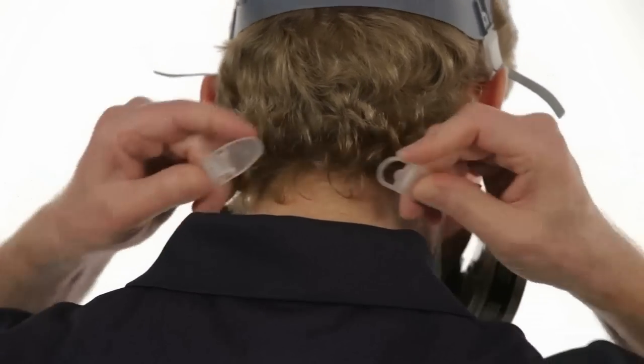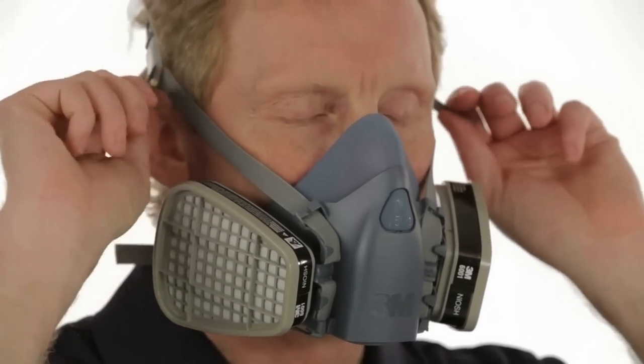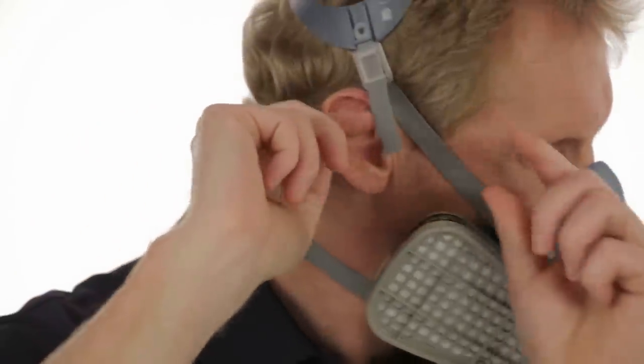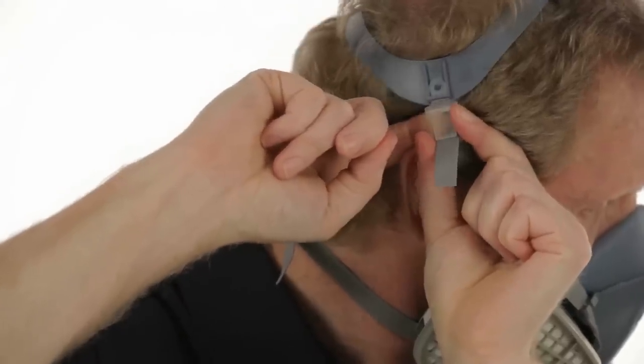Take the bottom straps in both hands and hook them together behind your neck. Tighten the straps by pulling on the ends — top straps first, then the bottom — until the respirator fits securely but comfortably. Do not over tighten. If the straps are too tight, push out on the back of the buckles to loosen them.